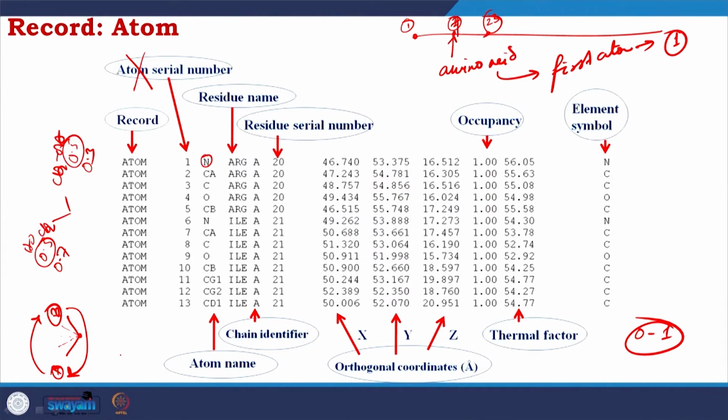Because the software measuring has a cutoff and it would not provide you the measure where the contribution is 0.1, 0.01 or something. There is a lowest cutoff. But if you develop a better software, you could identify other conformations, which would be invaluable in understanding the dynamic nature of that residue.